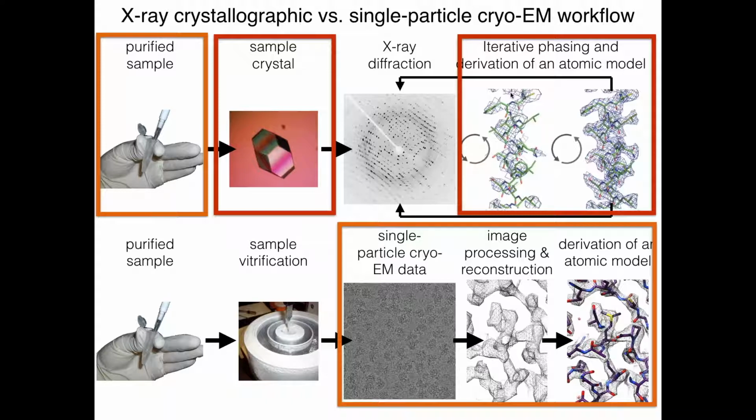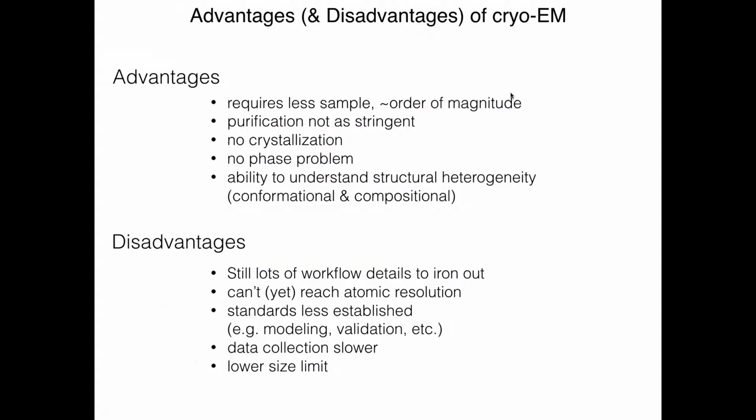Now with EM, this part is relatively more simple, but we still have bottlenecks in data collection, image processing, and reconstruction. And so the latter part of the pipeline is much slower. In fact, orders of magnitude slower.